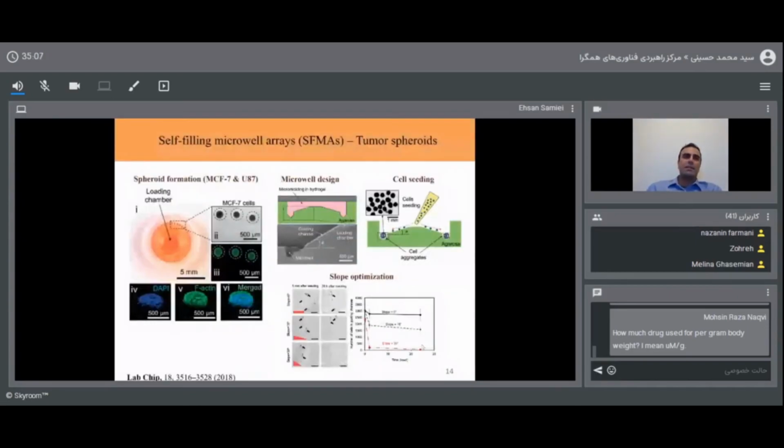Towards enhancing the tumor-on-chip and increasing its complexity, we considered developing tumor spheroids. As you may know, tumor spheroids are considered 3D cell culture platforms where cells aggregate, and over a certain period of culture time, they start to secrete their own native ECM, which is more physiologically relevant.